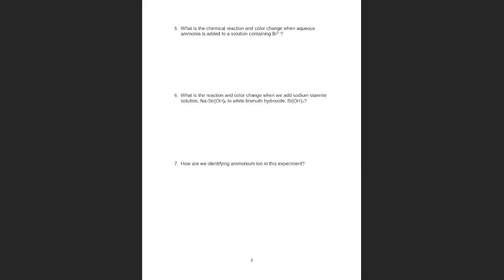The next question. Somebody wants to read it? You can go, Amanda. Yeah, I'll read it. It says, what is the chemical reaction and color change when aqueous ammonia is added to a solution containing bismuth? Okay, do you remember that? Black. Let's see.